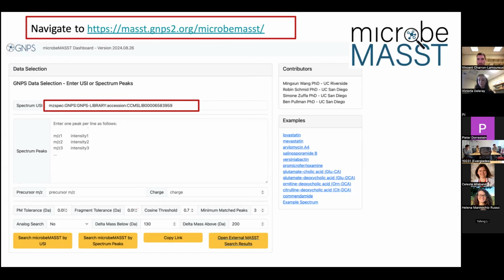I think in this case, actually, for me, sometimes it happens as well if I open it like a CSV file in Excel, and then I do some kind of modification, and then save it again. Instead of being a comma separated value, it will be semicolon separated value. I don't know why it happens. Maybe it was something that happened in that regard, Jerry, with you. Perhaps if you just download the table and don't open it in Excel and just import it into the R script, it will probably work smoothly.